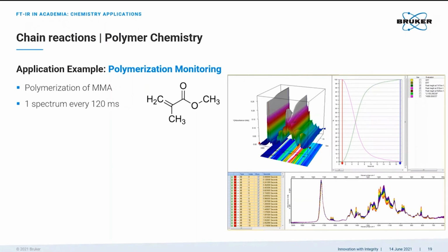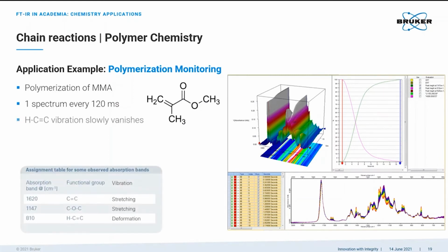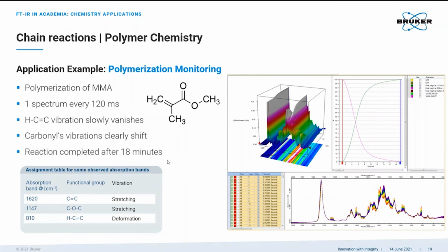Now we take a closer look at the result. Every 120 millisecond a spectrum has been taken. You can watch the HCC vibration slowly vanishing and a clear shift of the carbonyl vibration with advancing polymerization process. The reaction ends after about 18 minutes.